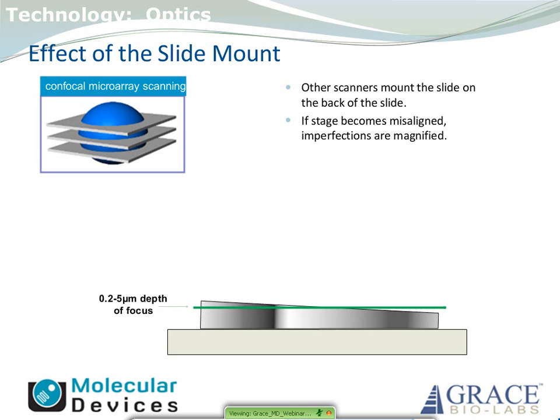And you can see this in example if I scan through the slide a couple of times. Here we have the mountain-like structures. It will be in focus and out of focus and in focus and out of focus. So the green, as you can tell, shows the laser beam and the narrow depth of focus. So it's actually not meant to be like this, as the image, if you scan it, will get brighter and darker as you scan.